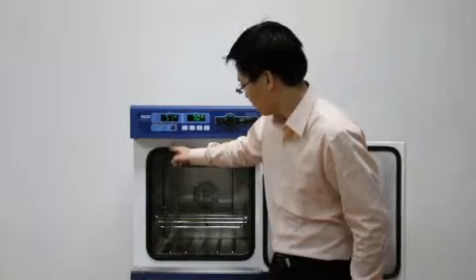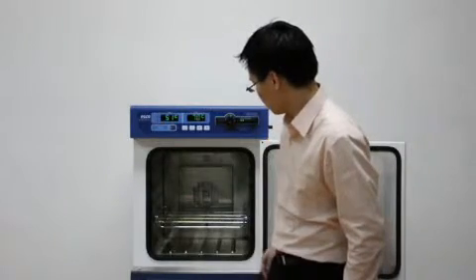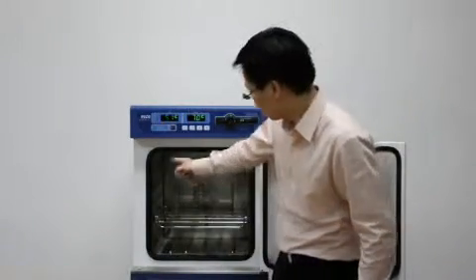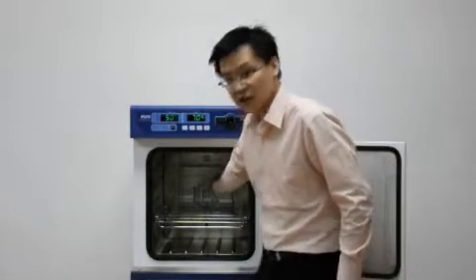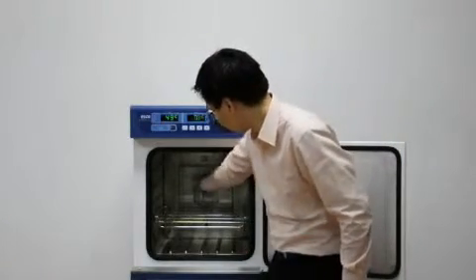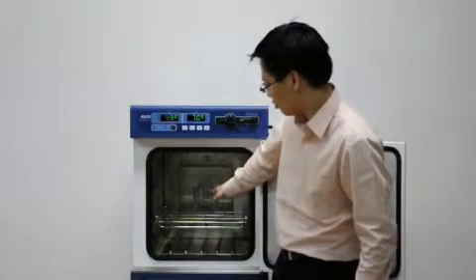In the chamber you have a gasket, single piece stainless steel chamber with all rounded corners, which facilitates cleaning, forced convection fan mounted at the rear of the chamber with a baffle plate to direct airflow within the chamber.